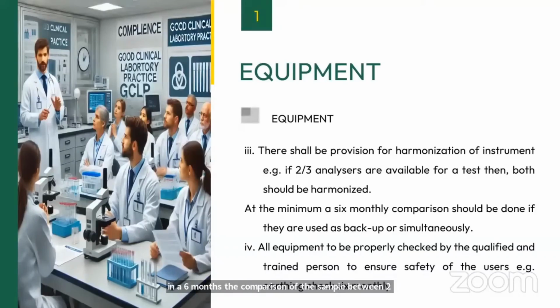All the equipment should be properly checked by qualified and trained personnel to ensure the safety of the user. So you should also have appropriate function checks and safety checks of the equipment, preferably again once in 6 months by qualified and trained personnel.